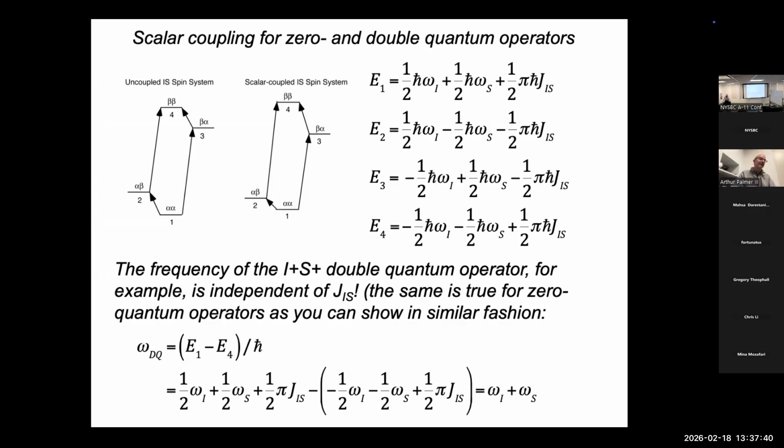There are pulse sequences then that try to make the evolution more broadband to solve this problem. But they're inevitably longer, so relaxation becomes a problem. So they haven't been used a lot, even though we've published a couple papers on them. So we wish they were used more.